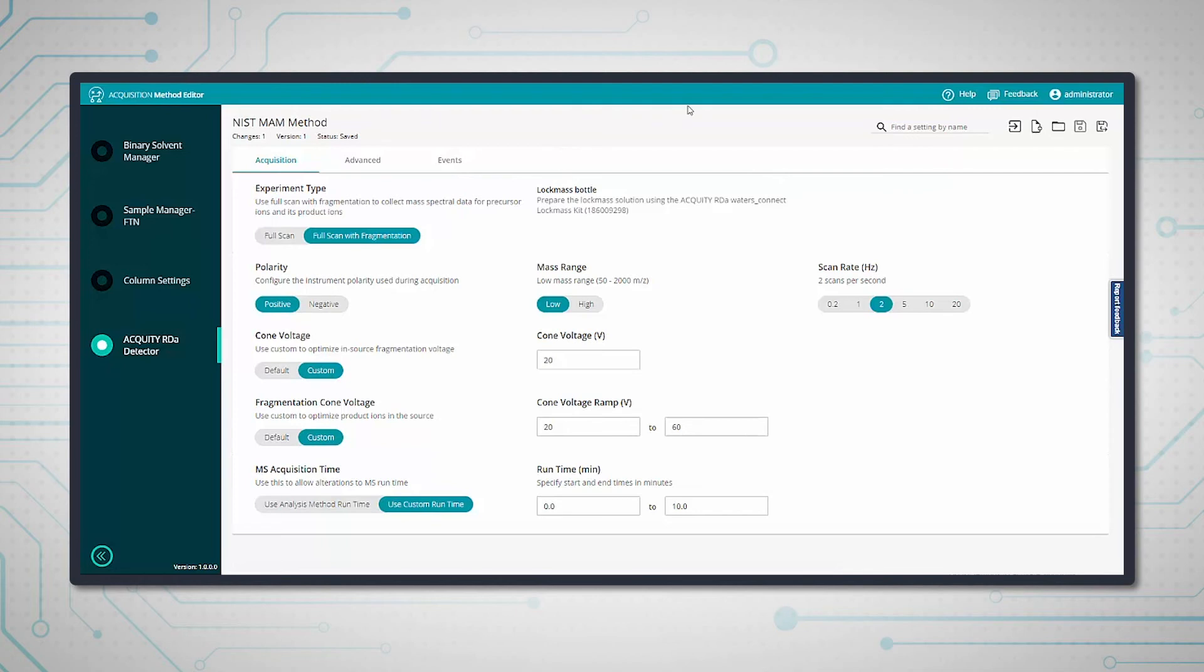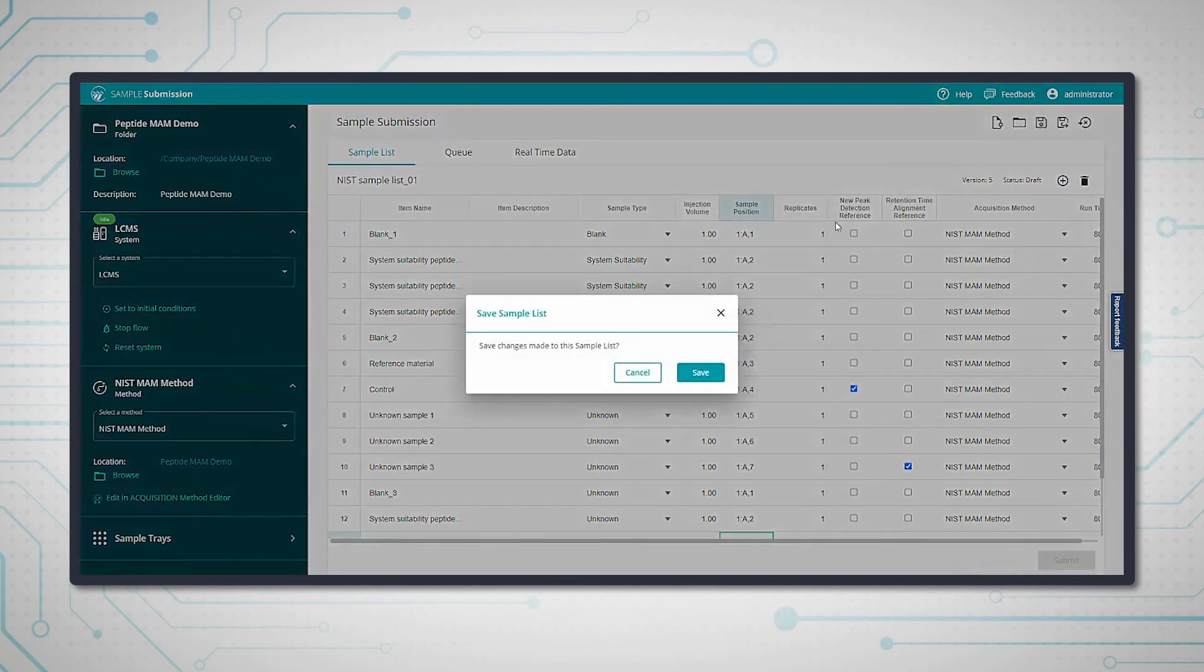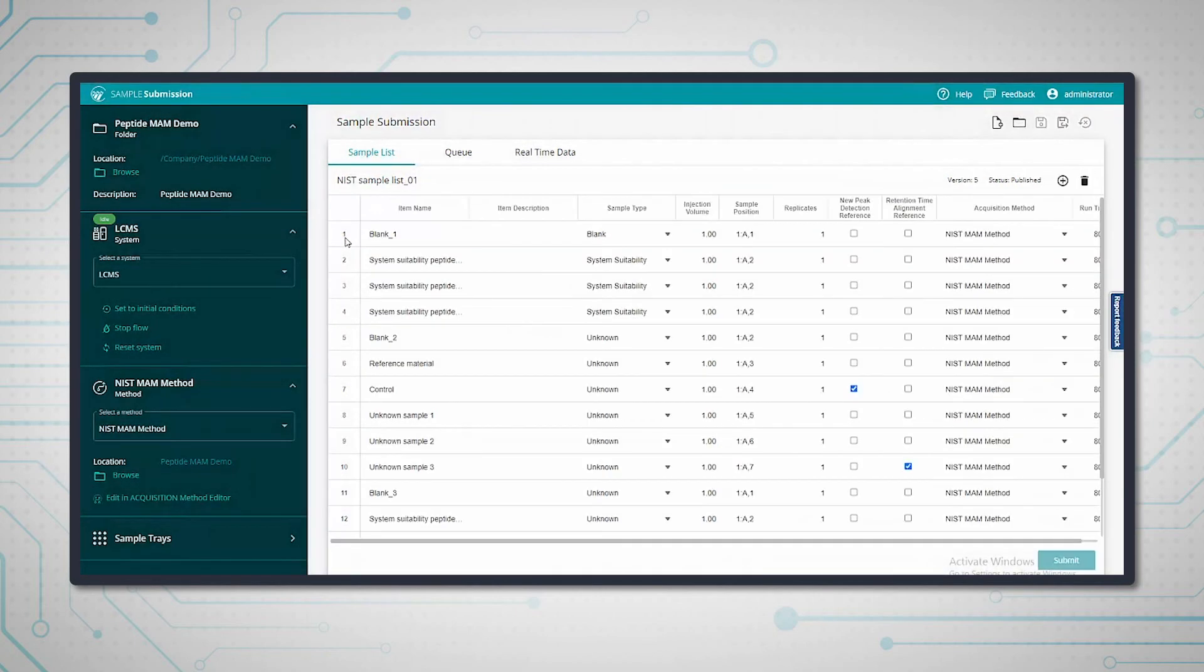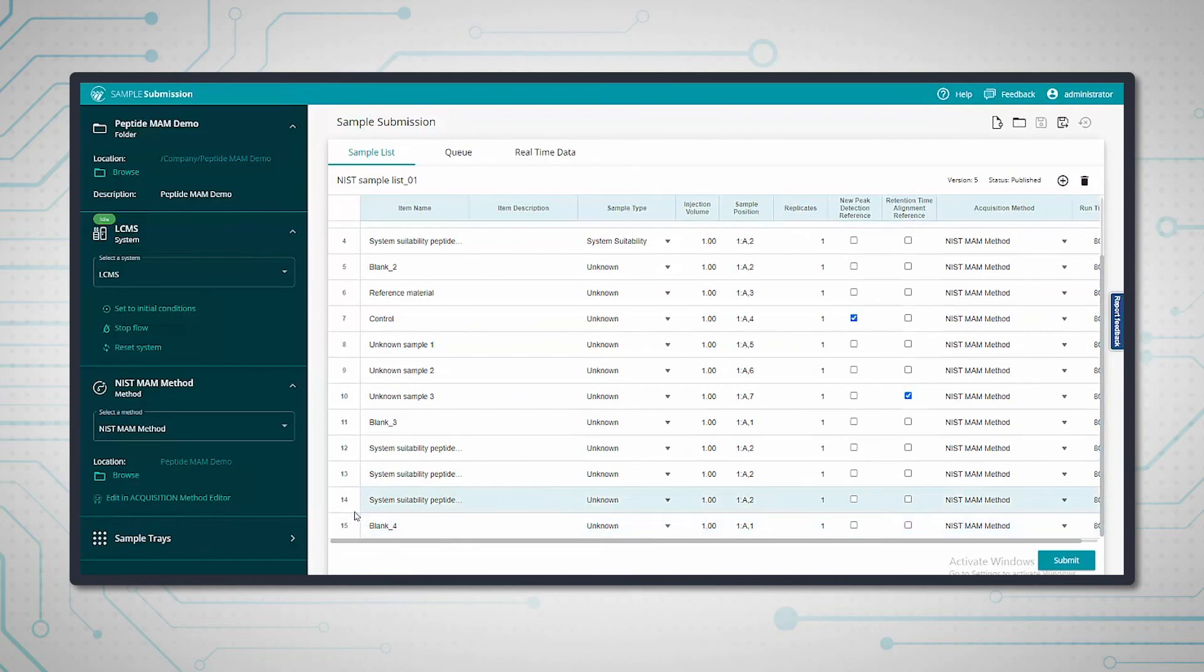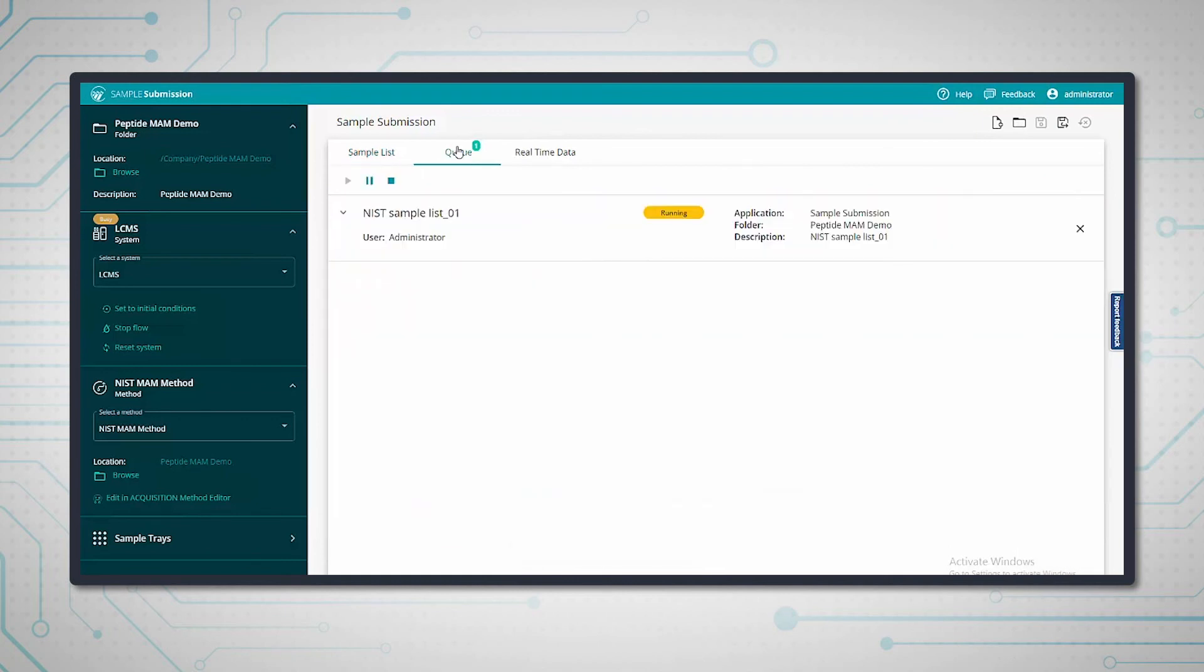Once you're happy that everything is ready to go, just save and then submit. Once the samples are acquired, they will begin to be processed.